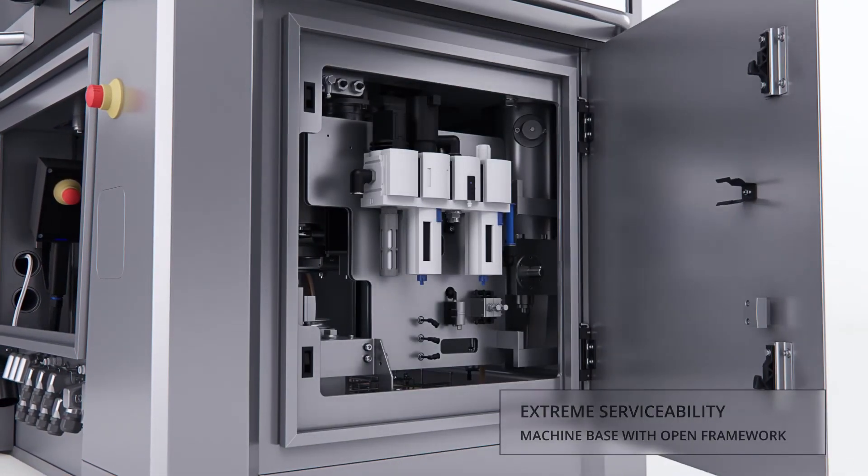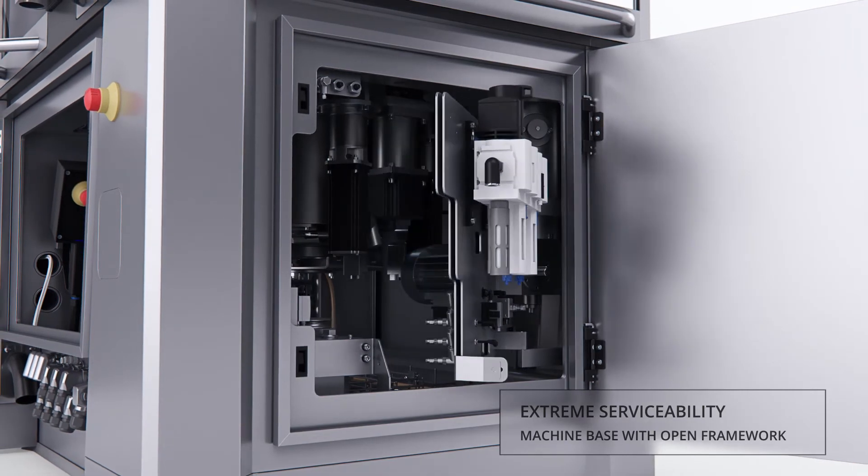Additionally, the components that need to be serviced are ergonomically placed at the front of the access panels.